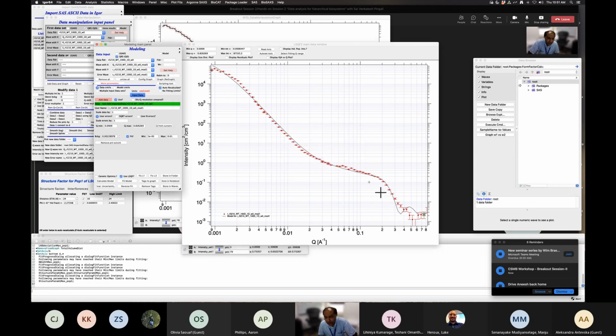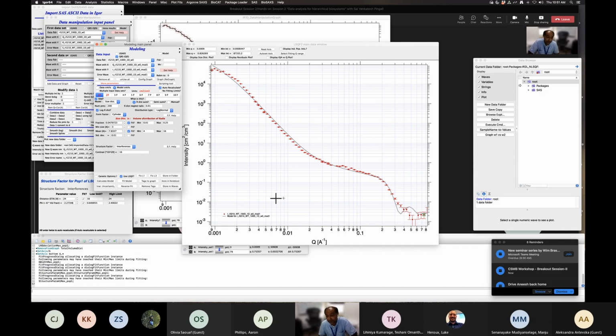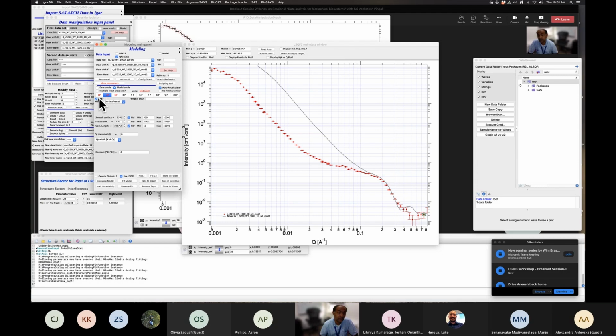So you can see that everything is, now we are able to fit that a bit better, but then it does show that there's a peak, which is possible. It's just we're not resolving the peak, but the form factor suggests there is a peak. May not be right.